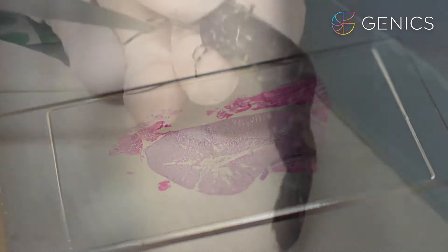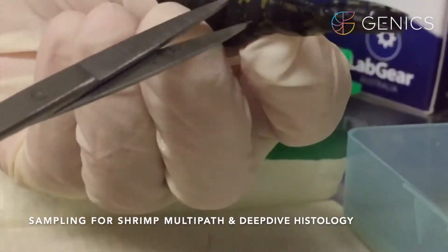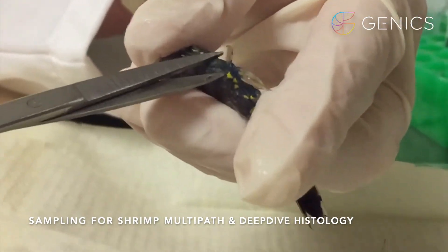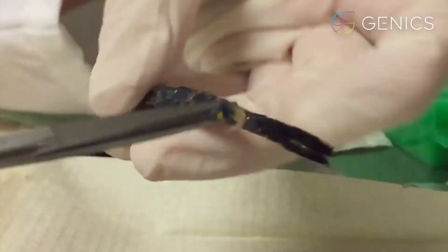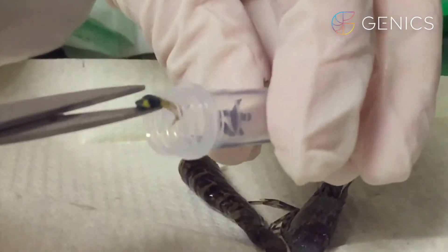First, we remove the tail of our shrimp that has already been euthanized on ice. Next, we cut off two pleopods for shrimp multipath testing. Once this is done, we take them and put them into our labelled tube.